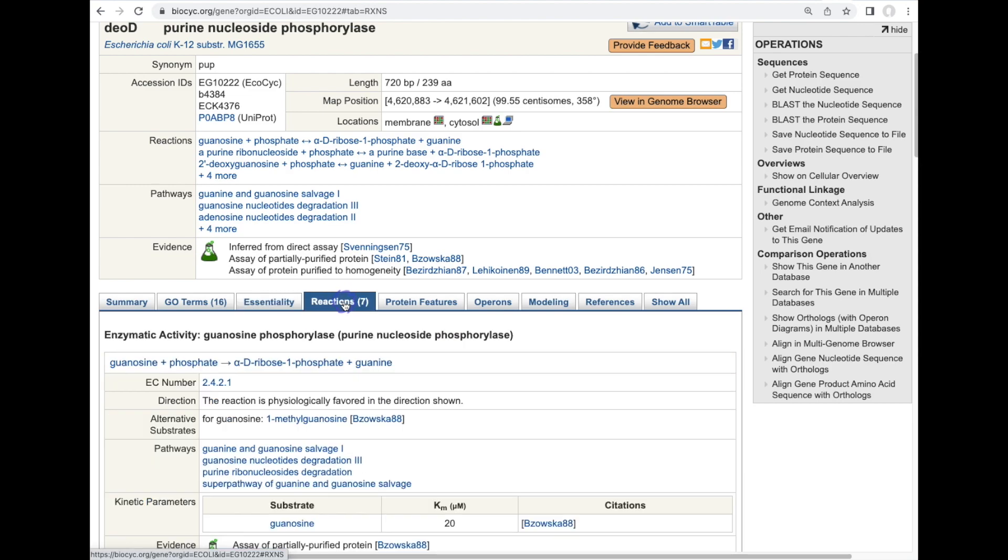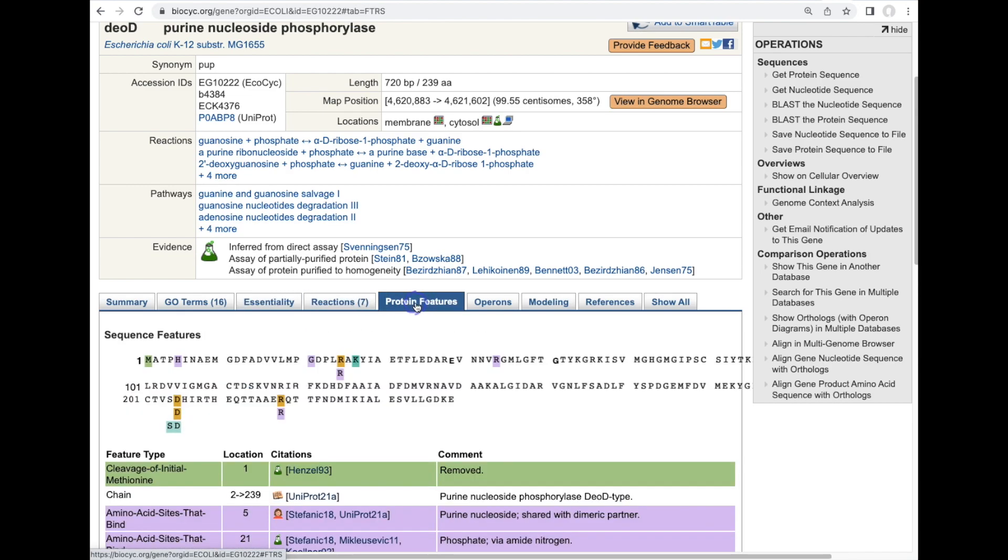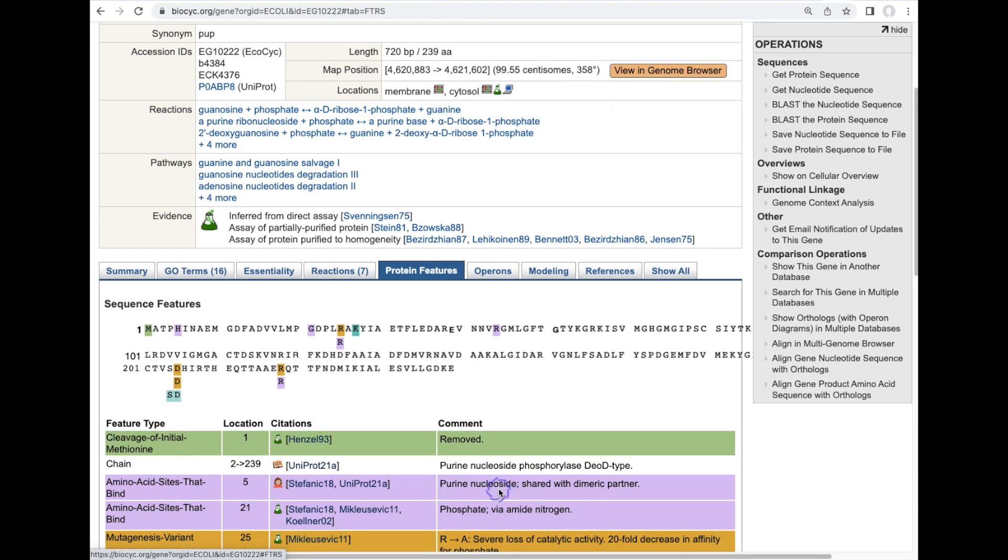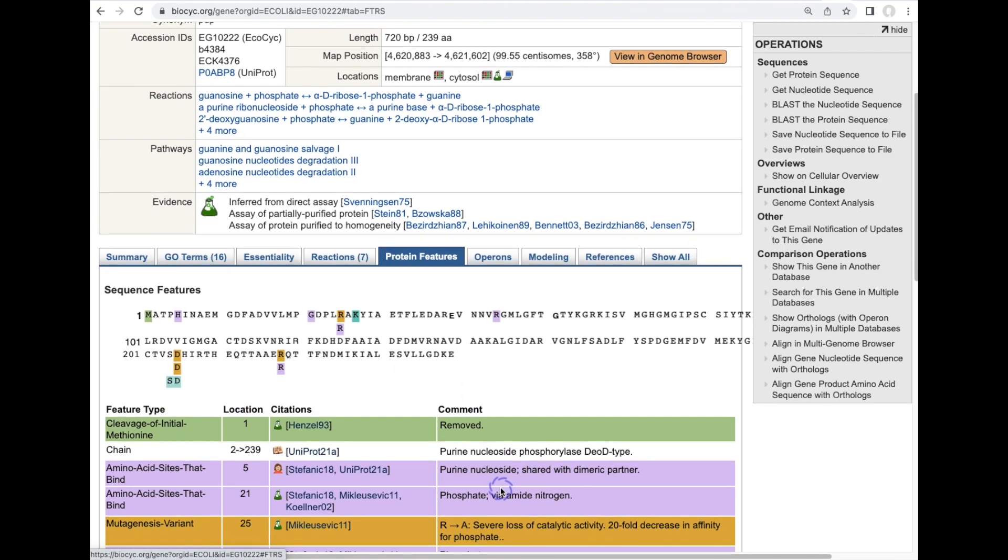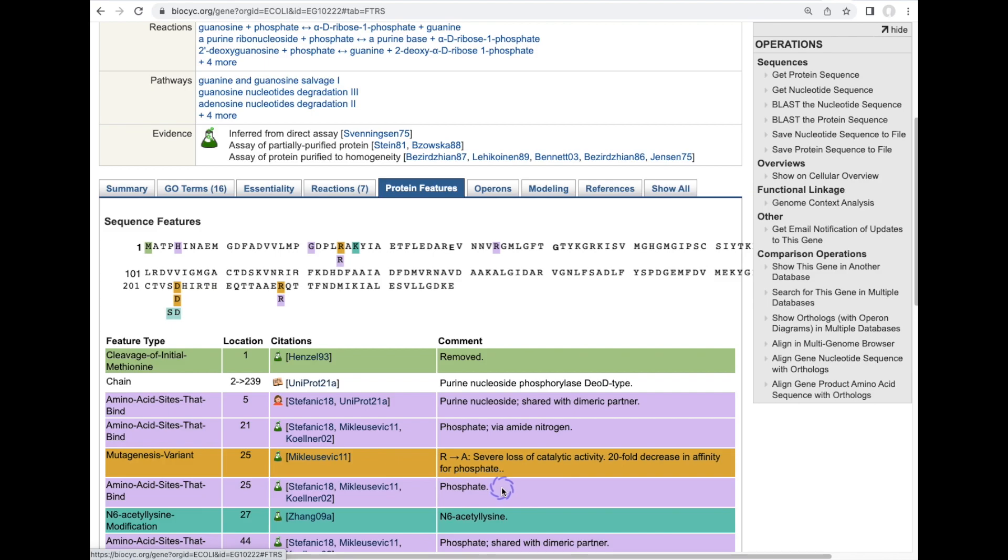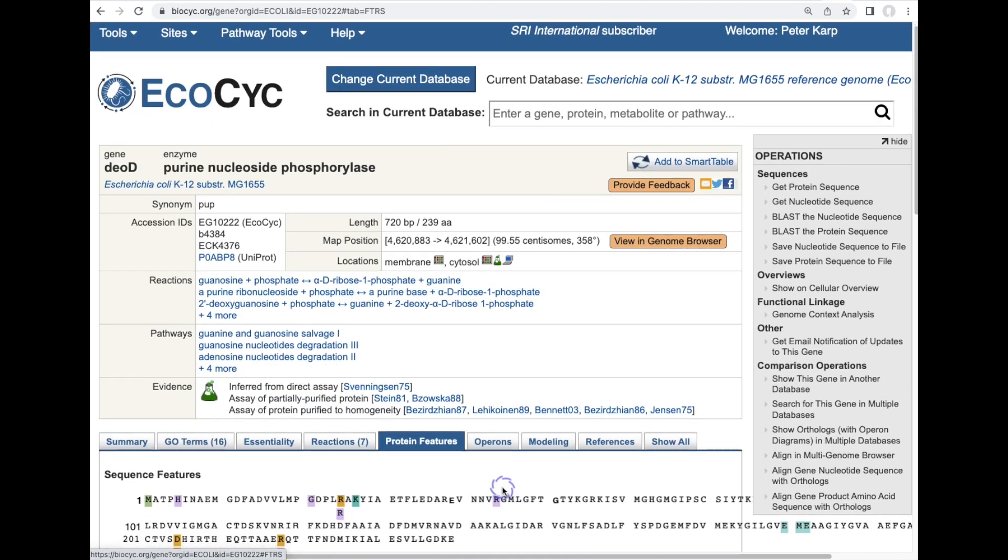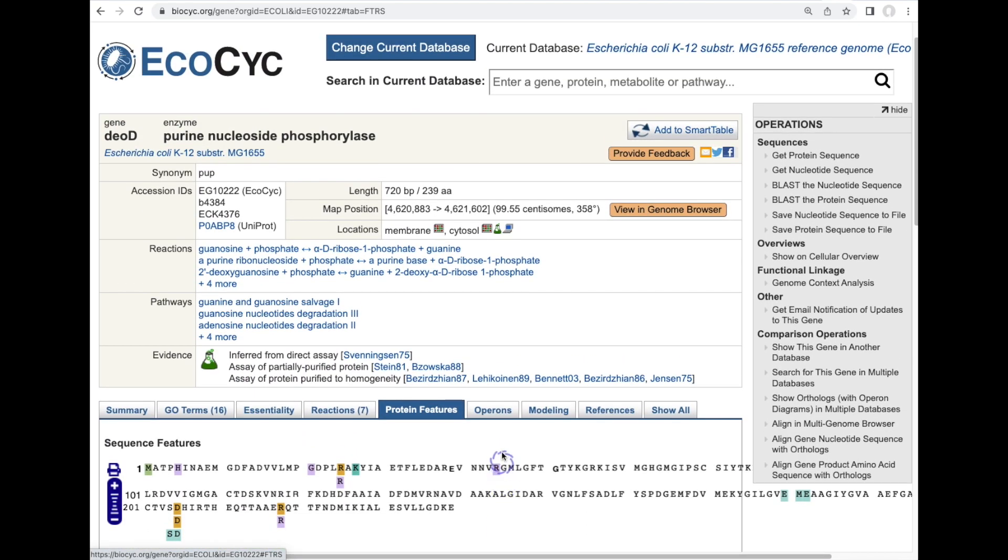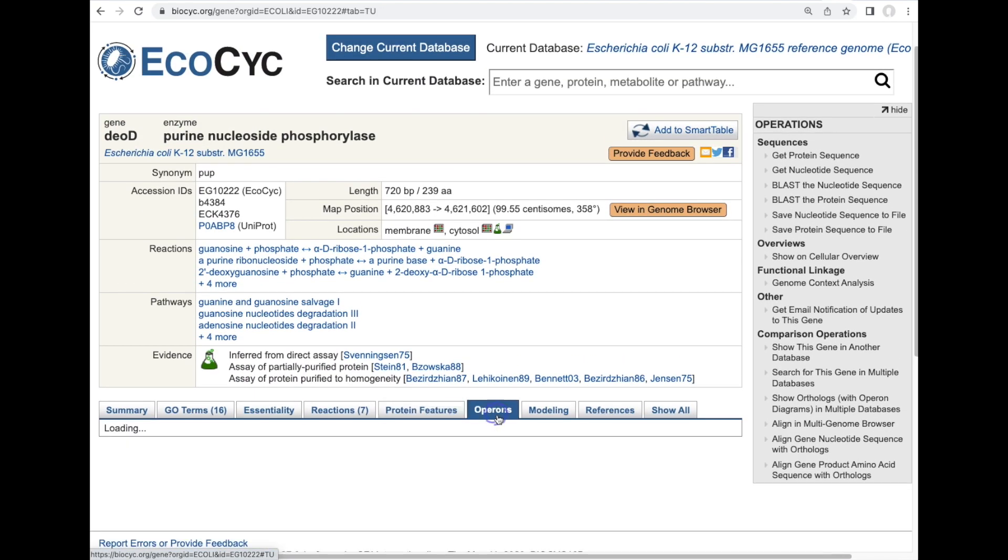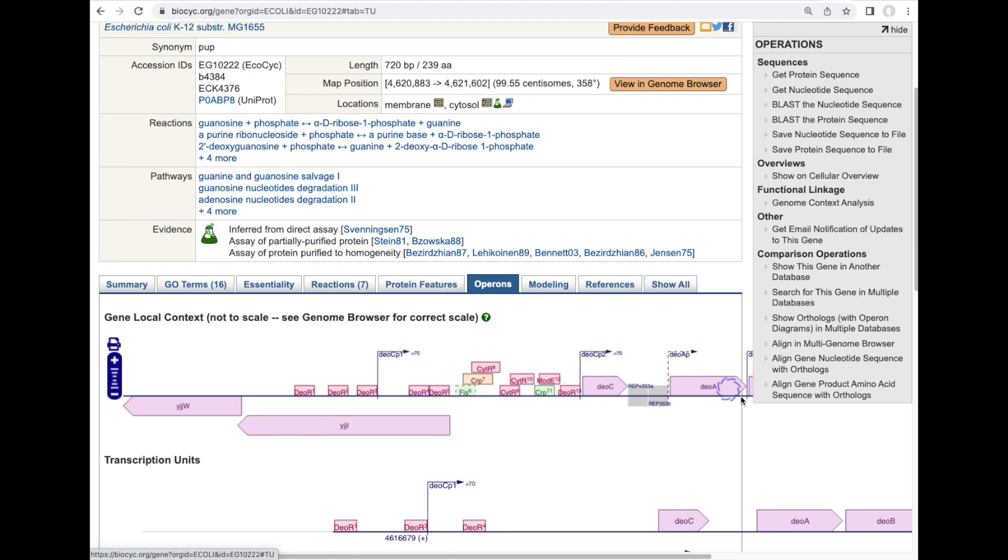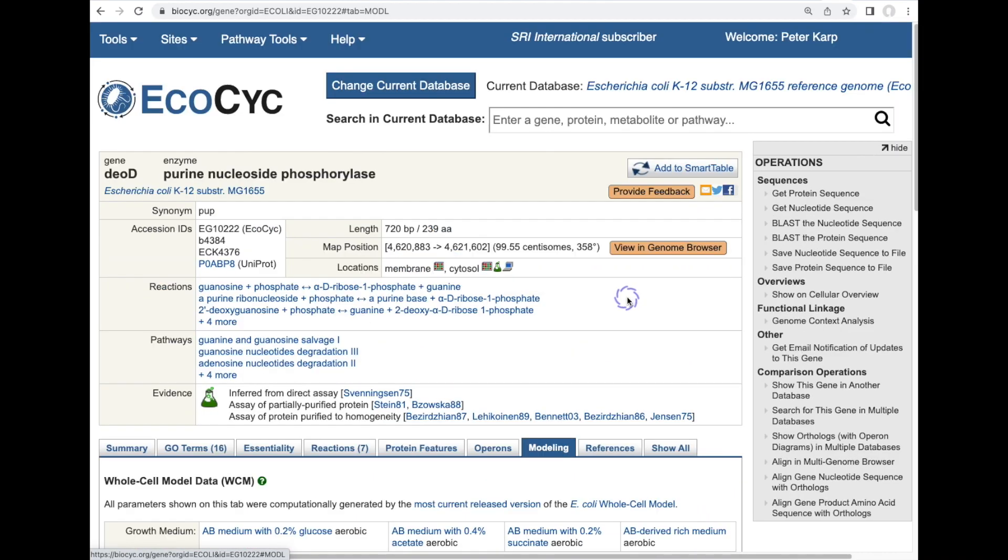Reactions that the gene catalyzes, protein features defined on the gene, such as phosphate binding sites, mutagenesis variants, metal ion binding sites. There also is the operon containing the gene shown here.